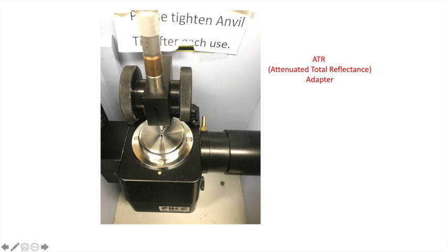And then when you have sample on the zinc selenide crystal, some of the infrared light leaches into the sample and it might be absorbed or not. And then it bounces back out onto another mirror off to the detector and we get our spectrum made. So that's the zinc selenide crystal right there.